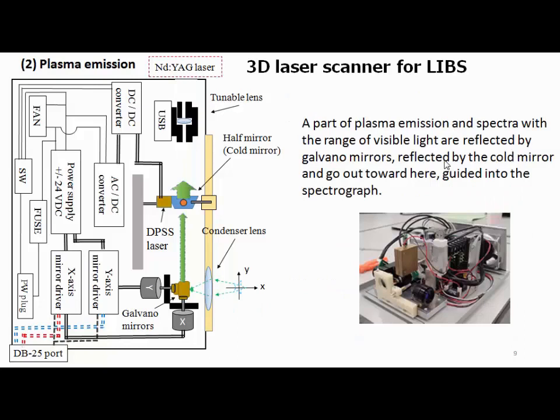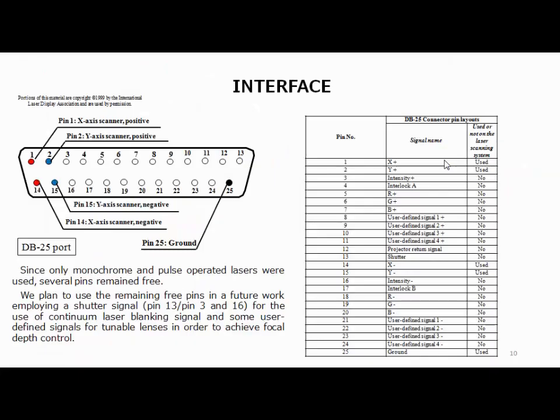The plasma is generated, and part of the plasma emission — which spans the visible light range — is reflected by the galvanometer mirror and then reflected by the cold mirror. The cold mirror only reflects light in the visible range.